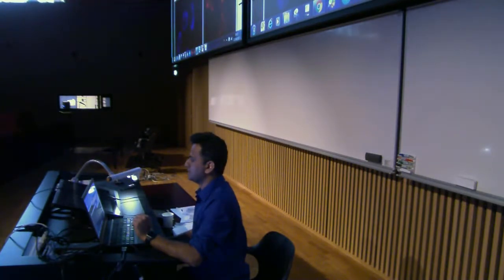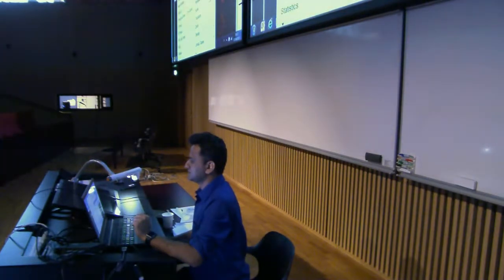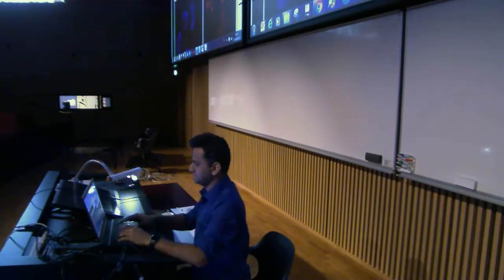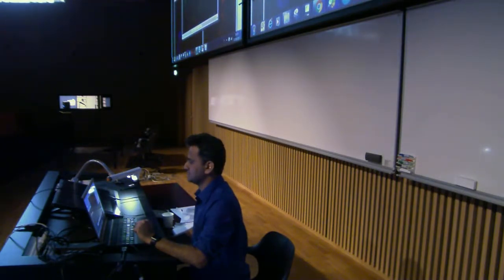Okay, and now I can go to Image, Stacks, and option Images to Stack. I have to give the name. Let's say Stack. Keep source images, it's a good idea to check this, and then everything is there. Okay, now it's stacked.